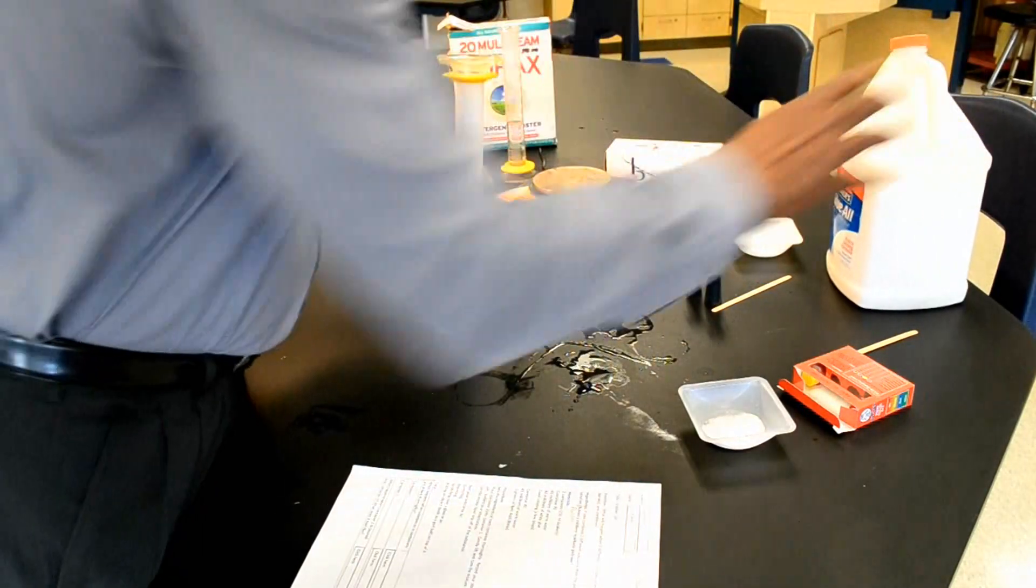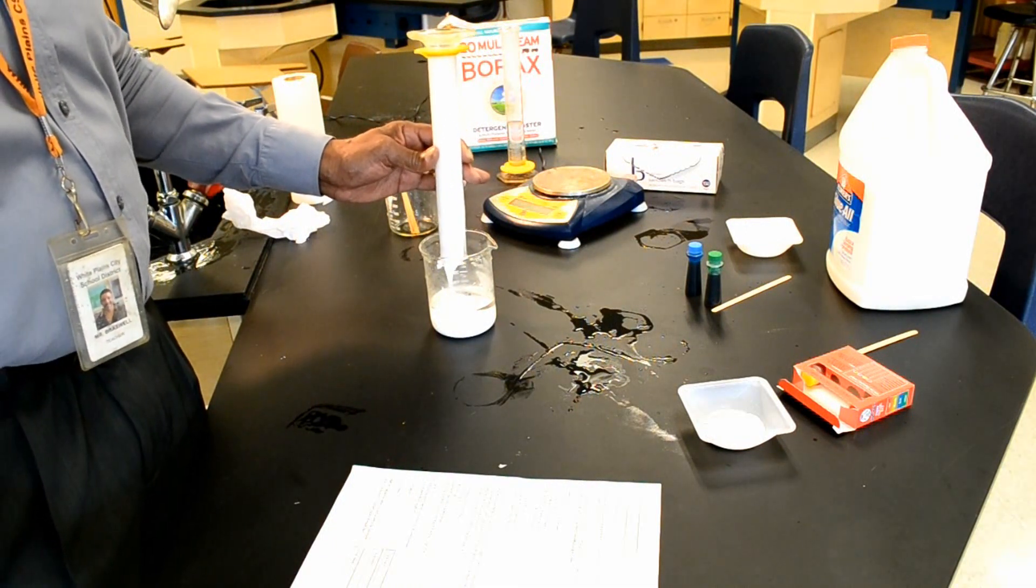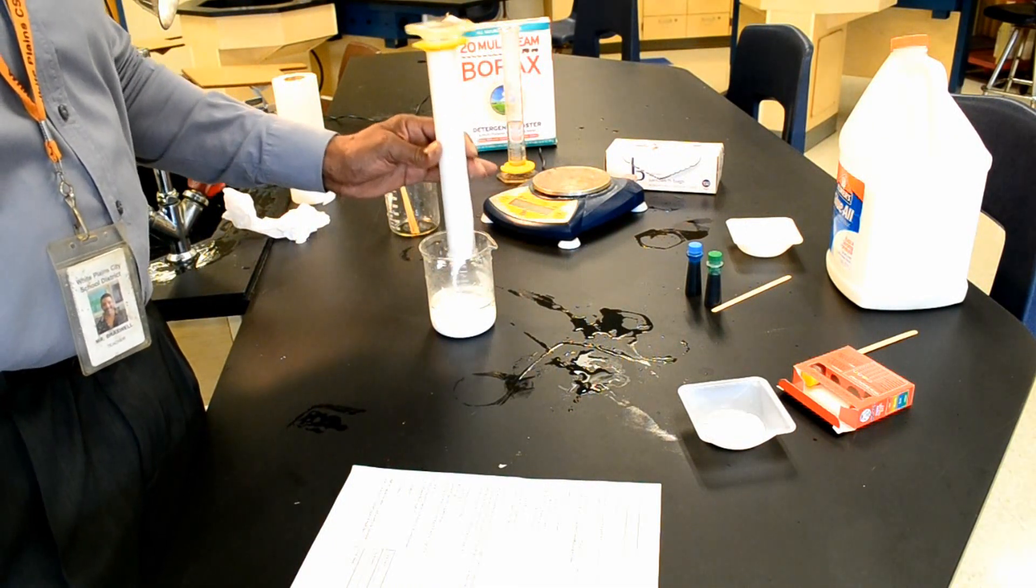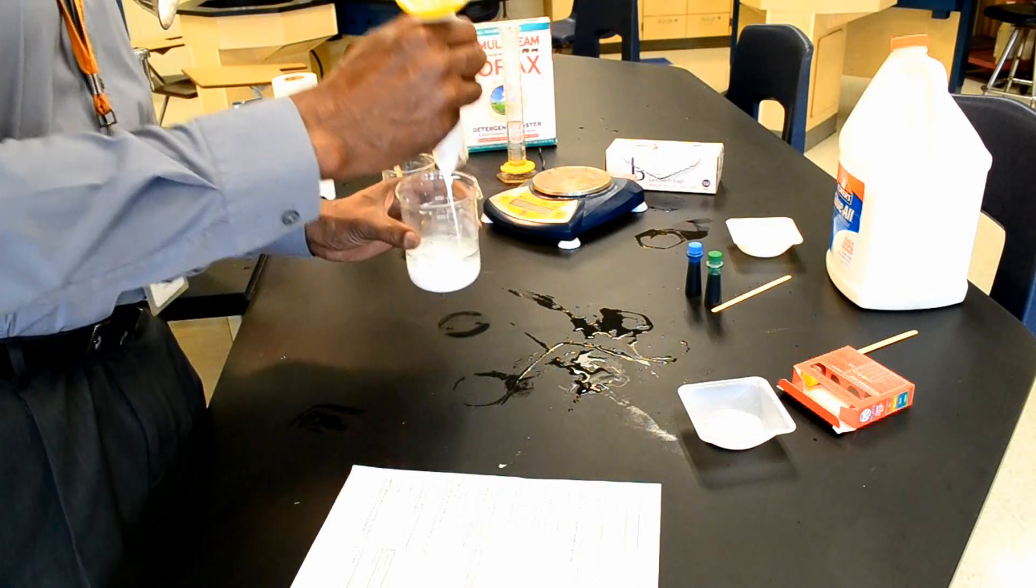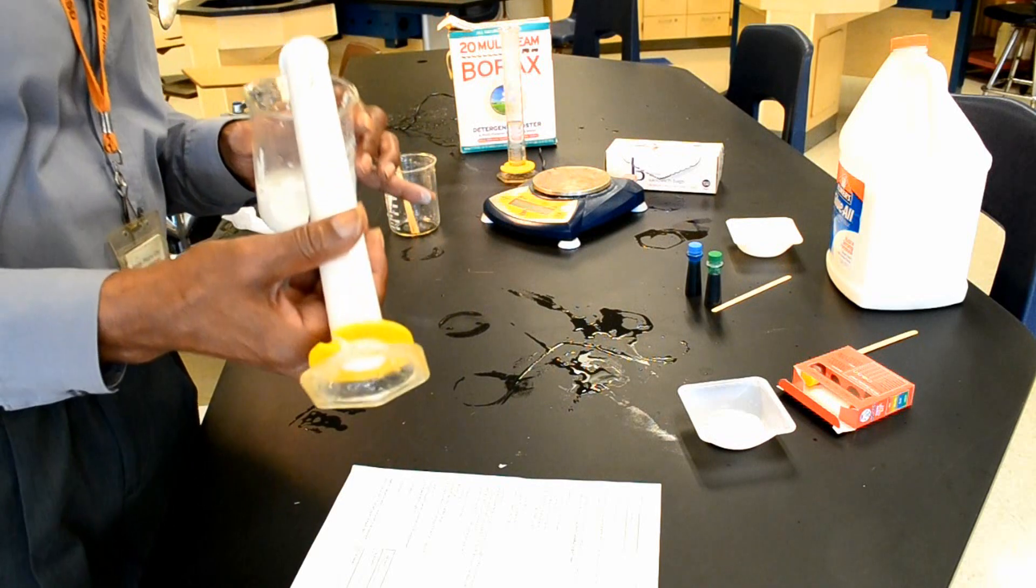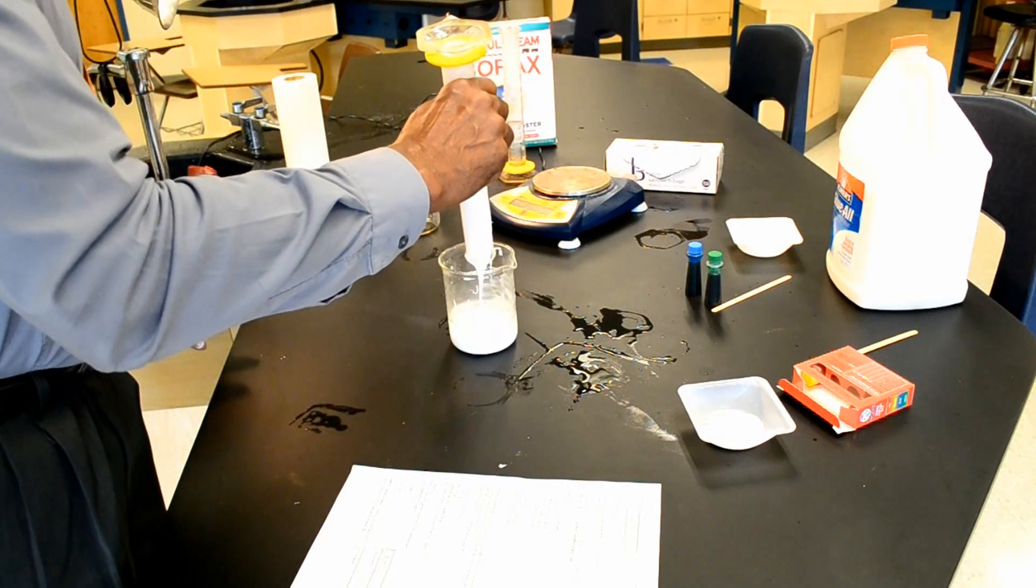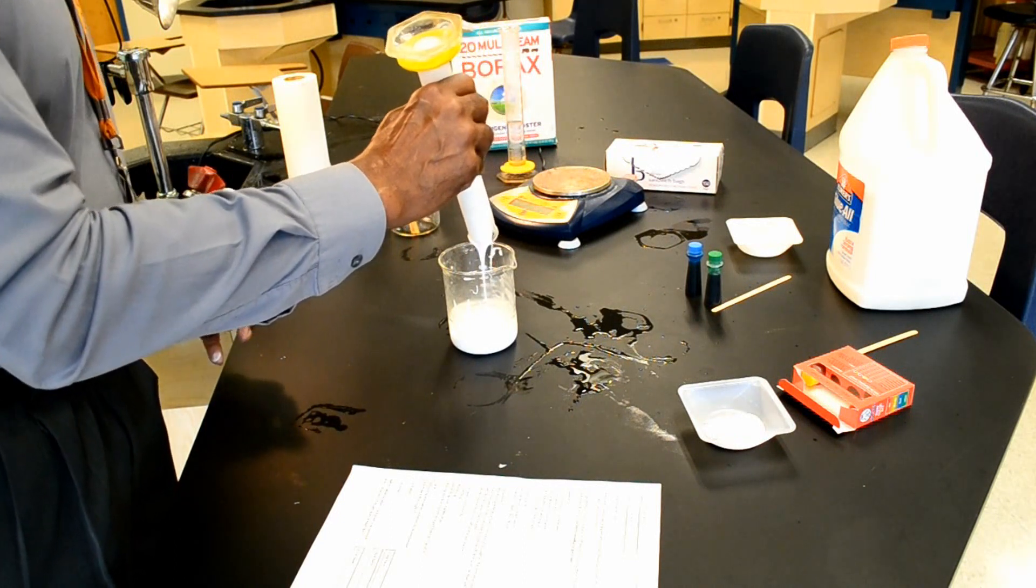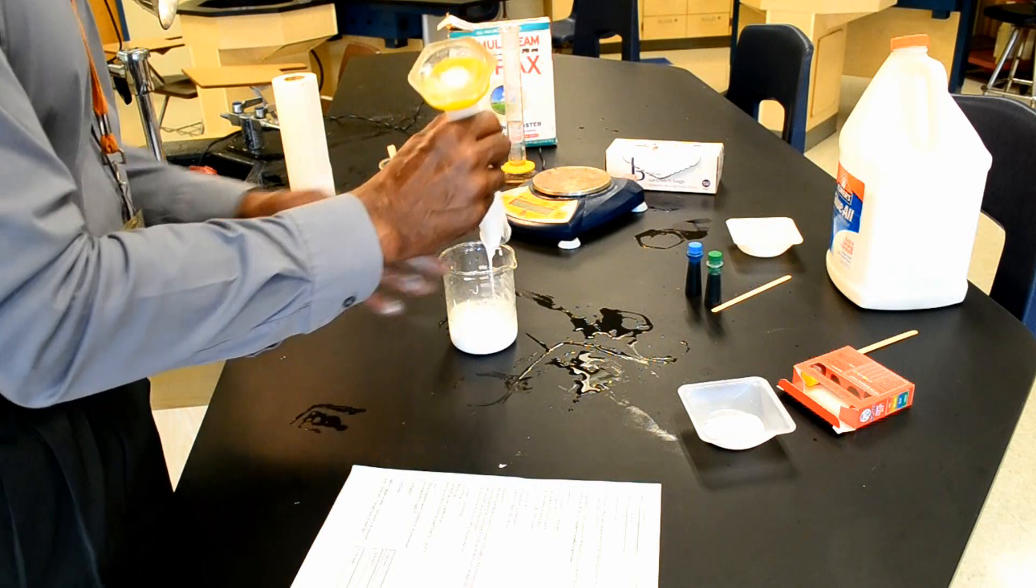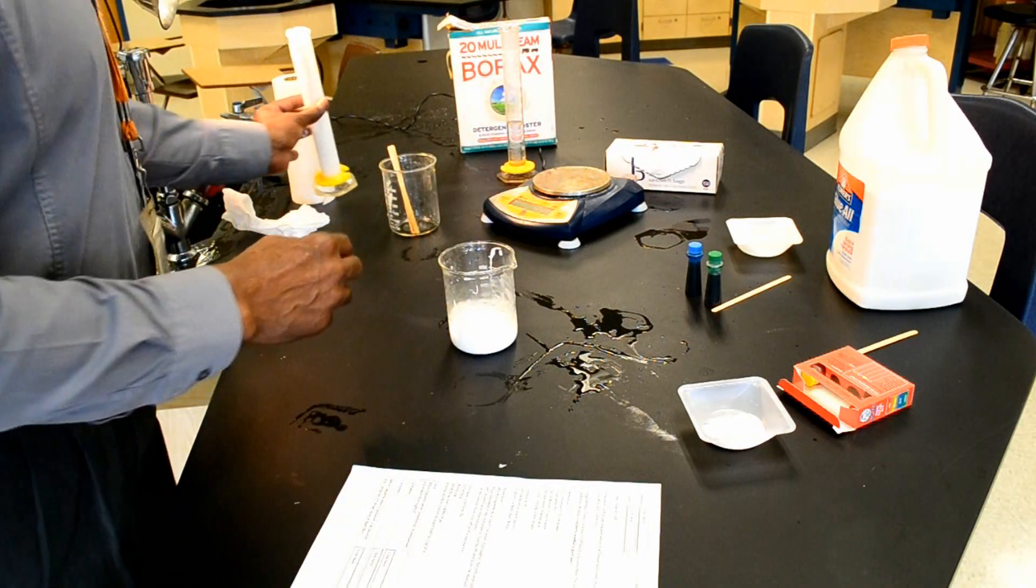Remember, when measuring liquids in chemistry, always use a graduated cylinder. I think that's just about all the glue that we're going to get out of the graduated cylinder. You can see it's still flowing a little bit, but we're going to forego that because I want this lab to be short and fun.